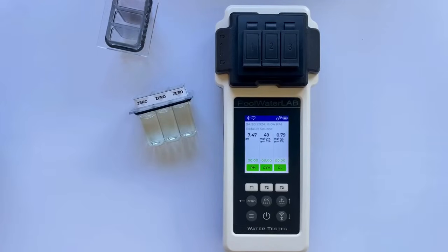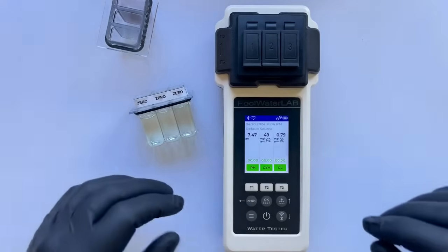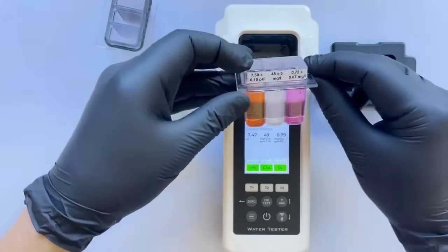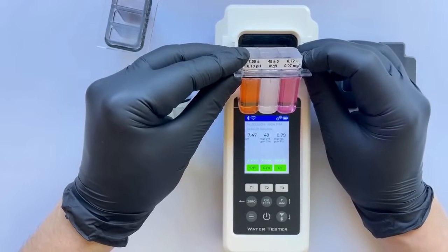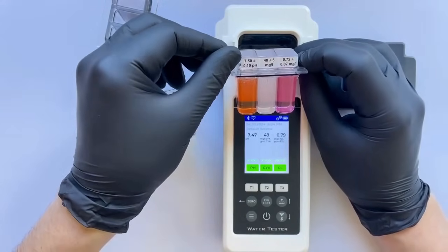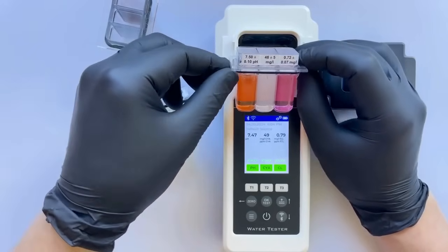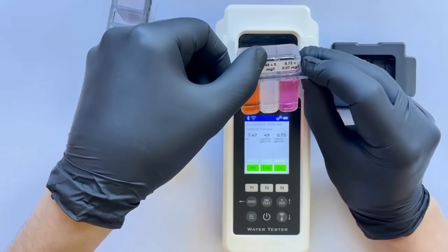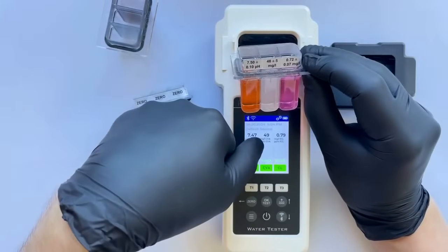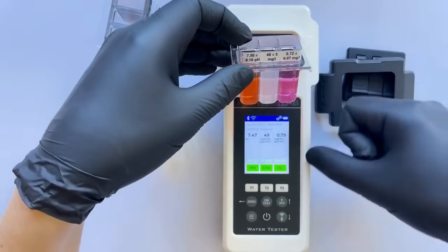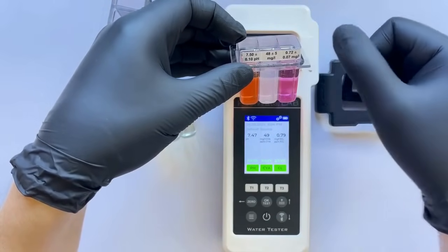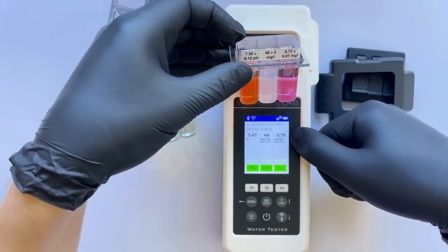Let's compare these with the results provided by an independent laboratory to verify their accuracy and ensure our measurements align with those of a certified testing facility. According to the independent laboratory, the pH result is 7.50, while our tester shows 7.47. For CYA, the independent laboratory recorded a value of 48, and our tester displayed 49. Regarding free chlorine, the independent laboratory reported a level of 0.72, whereas our tester gave a result of 0.79.